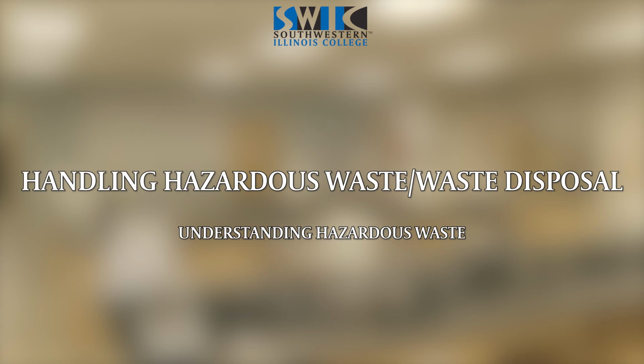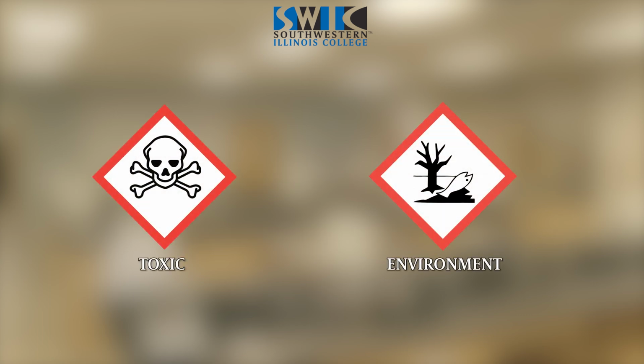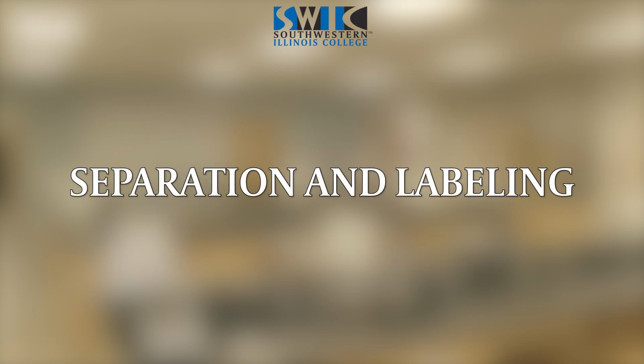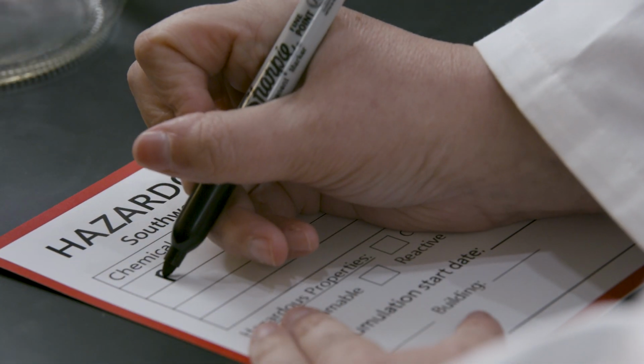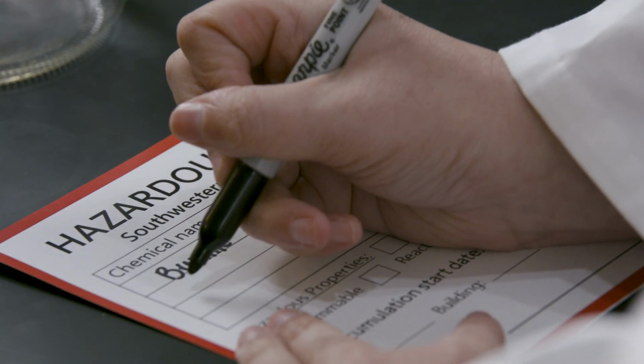First, let's understand what hazardous waste is. This includes any substance that poses a risk to human health, the environment, or both. In chemistry labs, we often generate waste that falls into this category. When handling hazardous waste, it's crucial to separate it properly. Store different types of waste separately to prevent chemical reactions. Ensure containers are clearly labeled with the waste's content and hazards using the aforementioned labels.